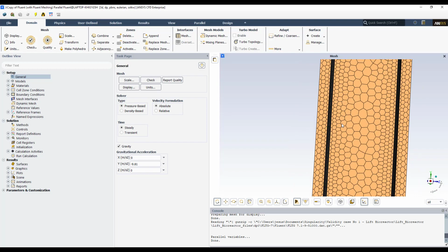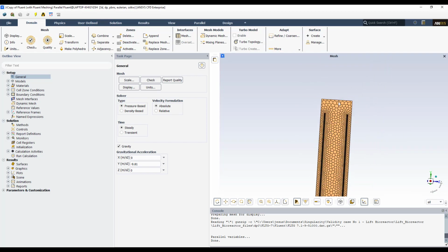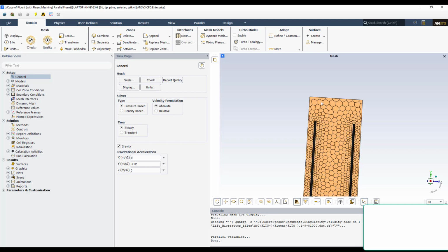As you can see, this is shorter than the geometry number one, because in this part I'm going to use a degassing boundary condition. Okay, I am not going to model the free surface, the interface between the mixture of water and air, and the air.